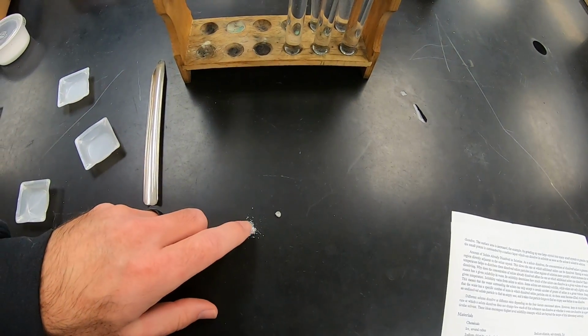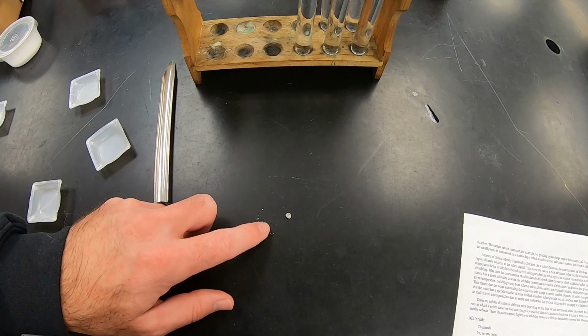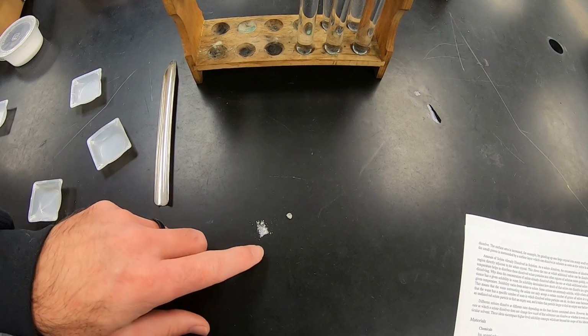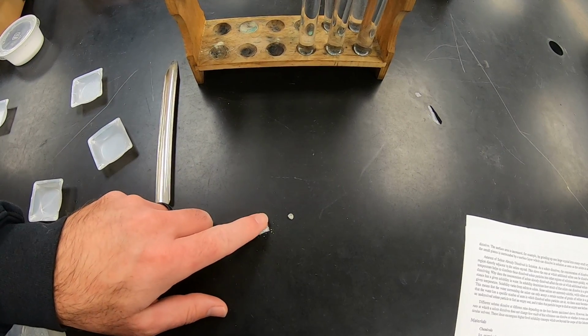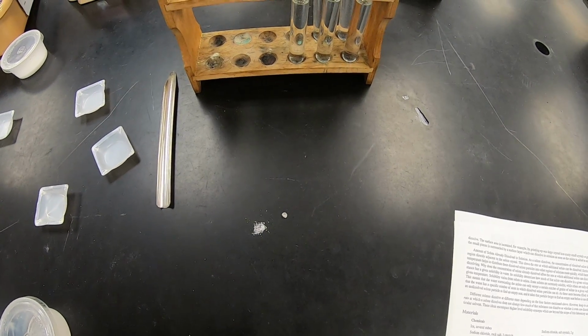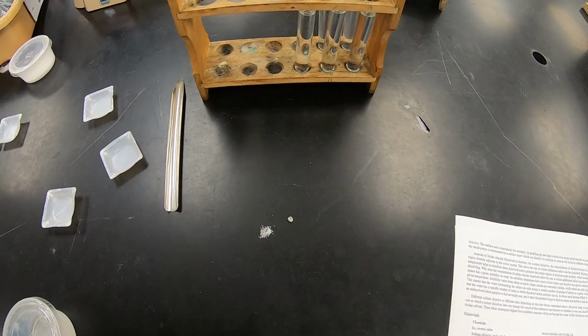so look at the piece of rock salt and look at the powdered salt here. Which one has more surface? Well, you can definitely spread out the powdered salt a lot more. So the powdered salt has much more surface area than an equal sized piece of rock salt. So that's why powdered salt has more surface area. Rock salt would have the least surface area.